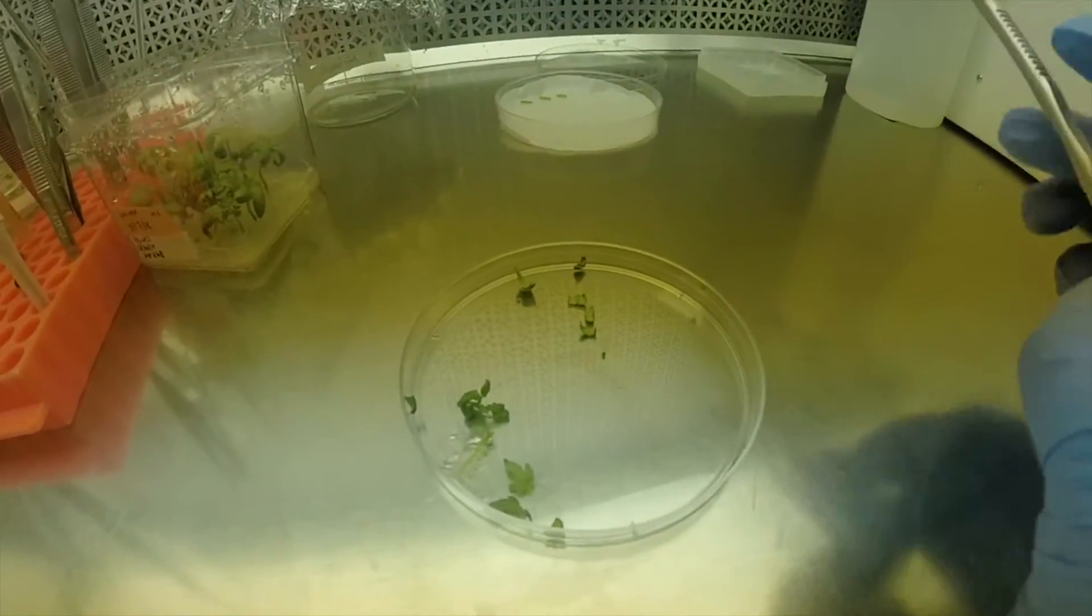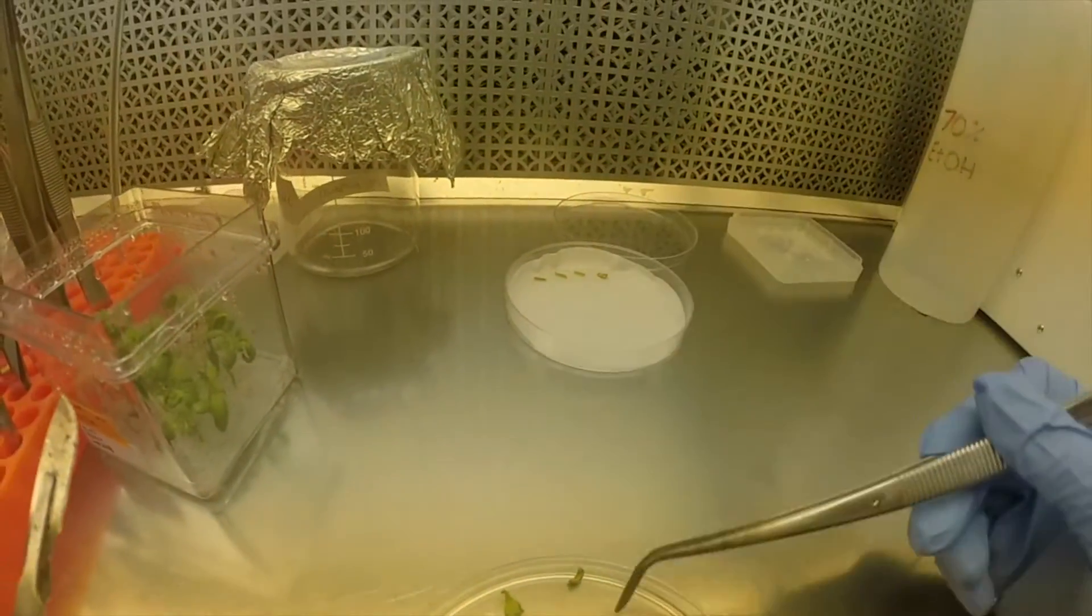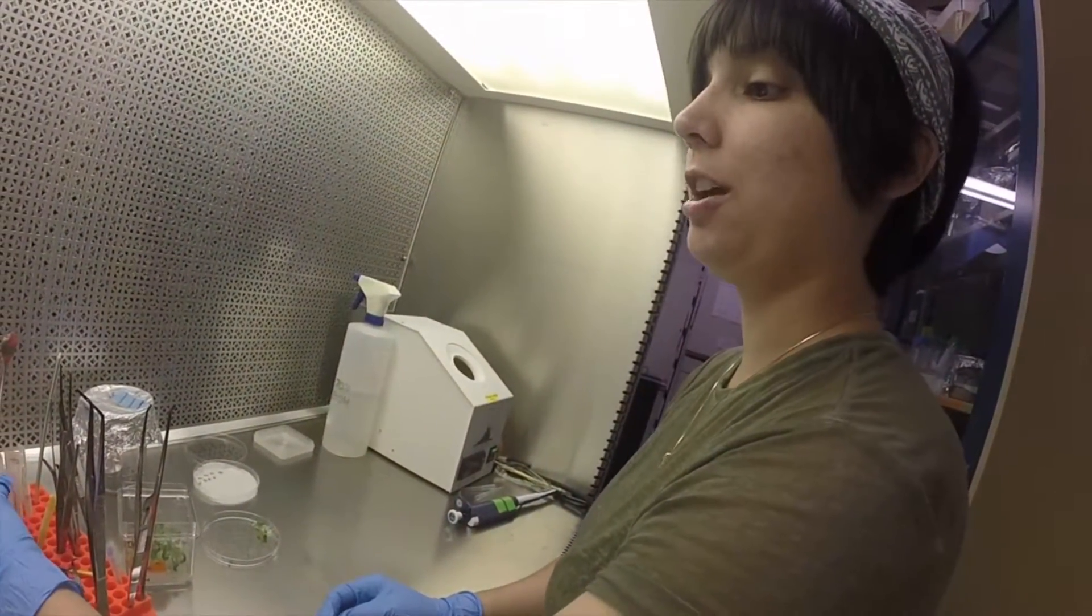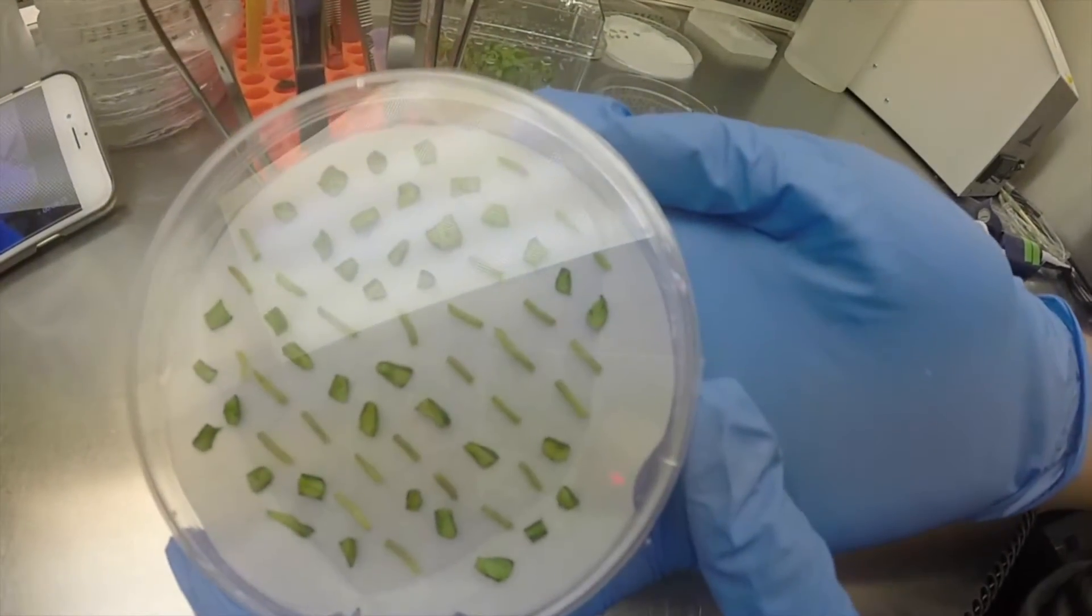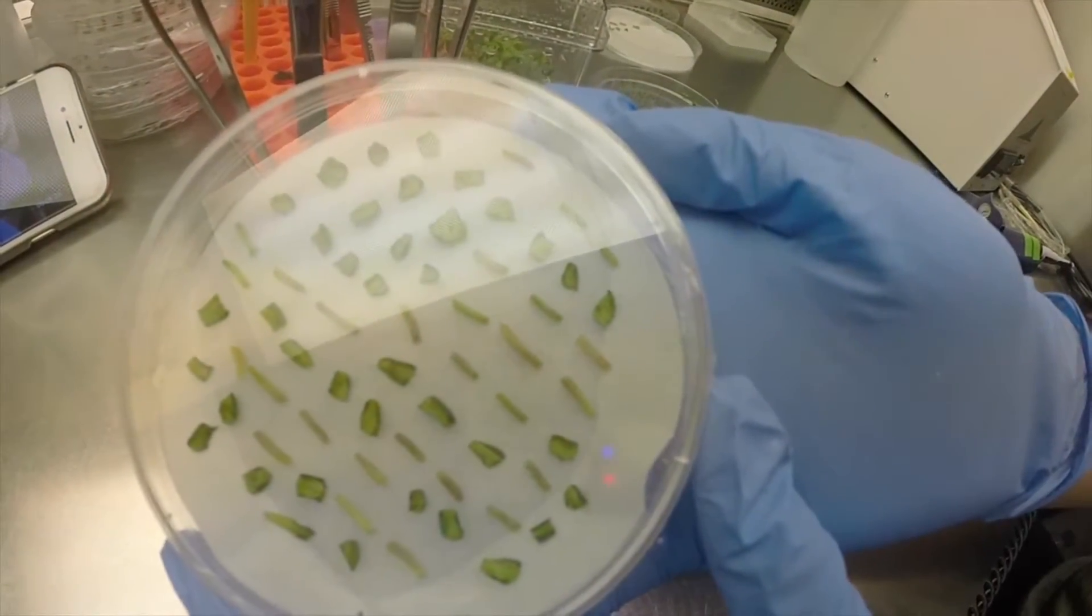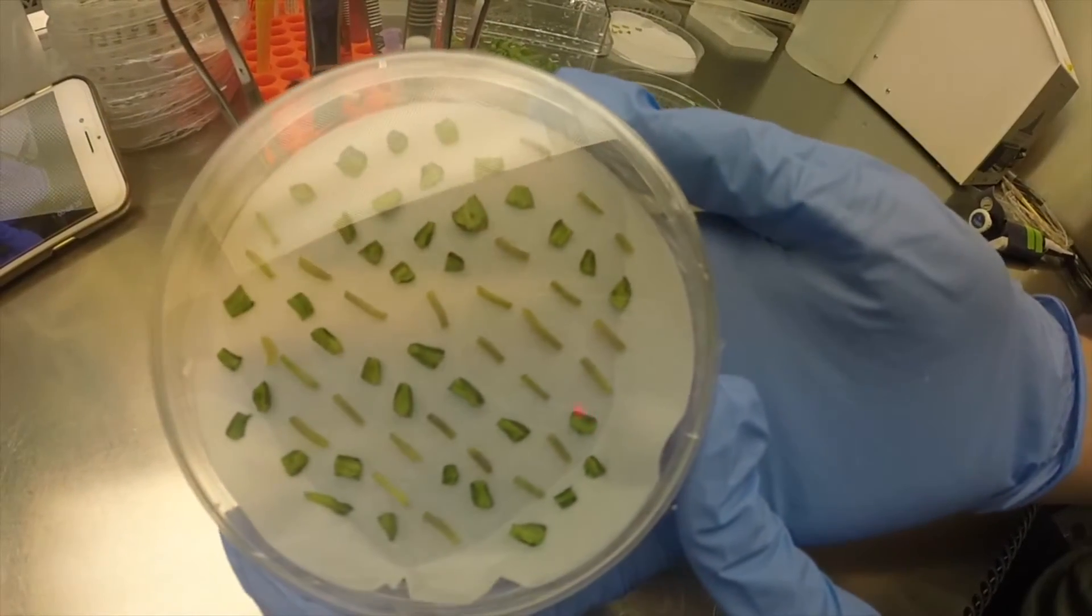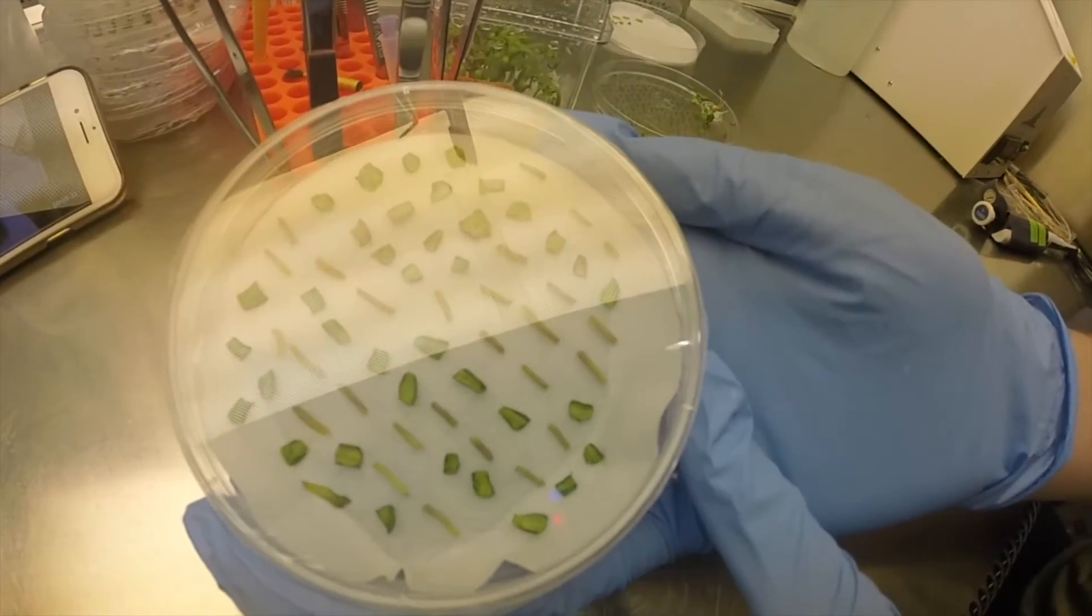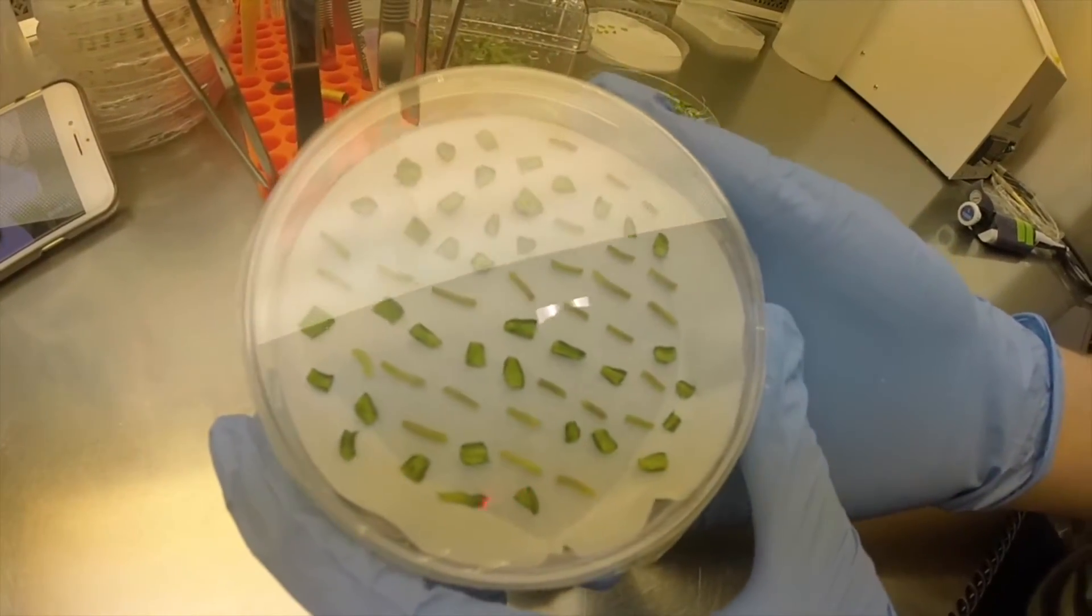Again we're going to immediately transfer these to our media. Once you're done, the plates should look something similar to this where we have a full plate but not overcrowded with a combination of meristems and cotyledons. You can separate these two if you would like or leave them all combined. That is a preference.